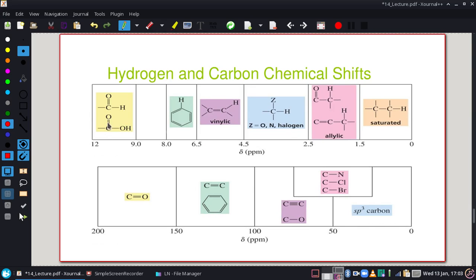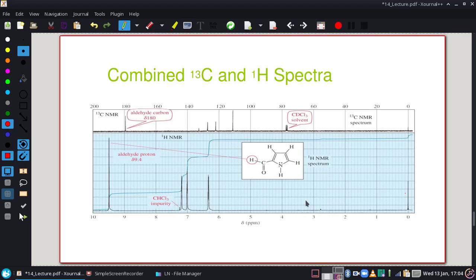So we do see carbonyls shift very, very high, just like carbonyls cause the hydrogens to shift. And we do see that benzene pop up here. But what we see different, even our double bonds are here. All double bonds show up between 100 and 150, yet before, some double bonds cause the hydrogens to be here and these hydrogens to move up here. So they do show up in different locations. The chemical shifts are far greater, but I do want you to notice also on this, the peaks are a heck of a lot different in height.